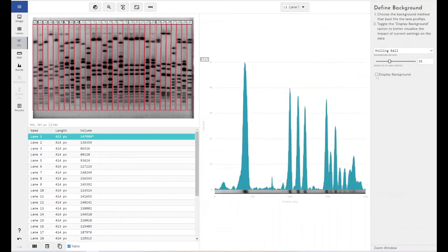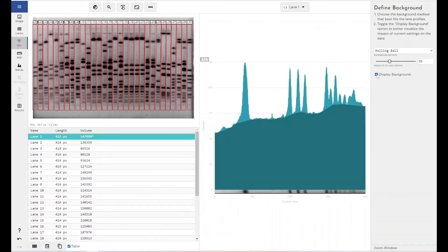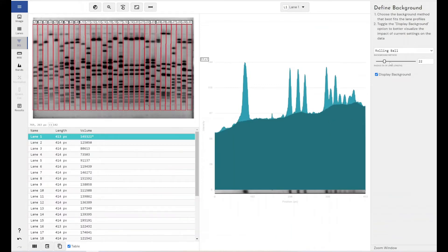You can turn this off to see what your peaks would look like just with the current settings. But this dark blue area here is what will be removed from all of my intensity measurements. So that's how the rolling ball method works.